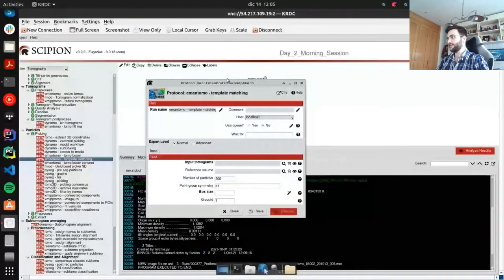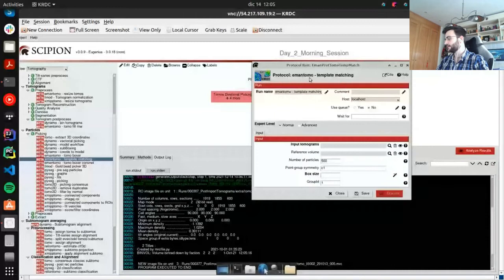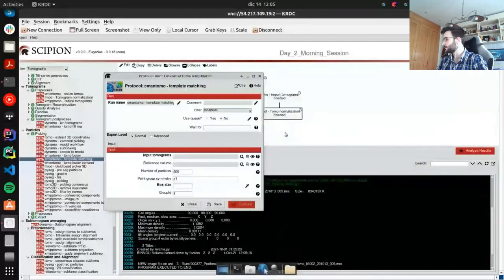This one has a little bit bigger. Seems to be done for Dimitri. It's also done for me. Is everyone done with it?